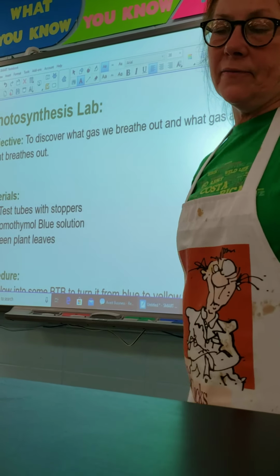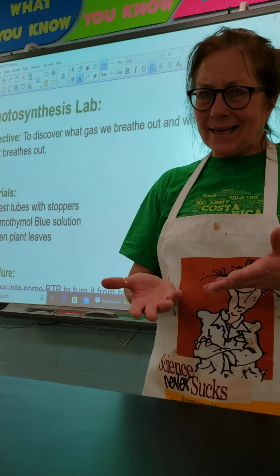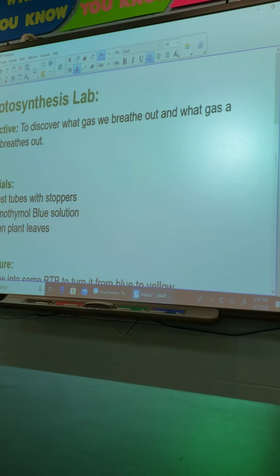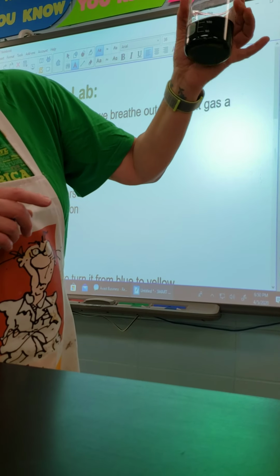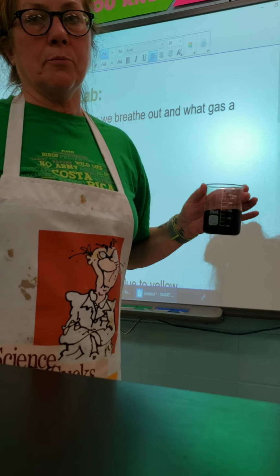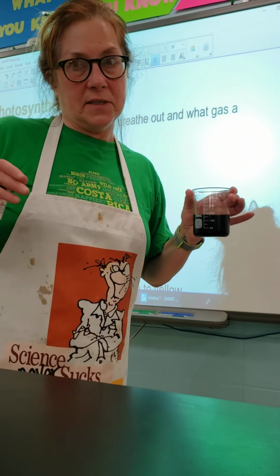Photosynthesis Lab. Our objective today is to discover what gases we breathe out and what gases a plant breathes out. How are we going to do that? Let me show you. I have this blue liquid. Well, actually, it looks greenish blue. It's called bromothymol blue. Now, instead of saying bromothymol blue all the time and even spelling that, we call it BTB for short. It's easier.